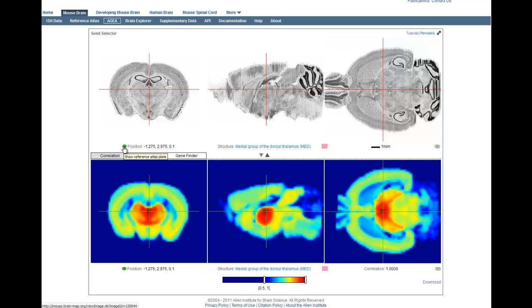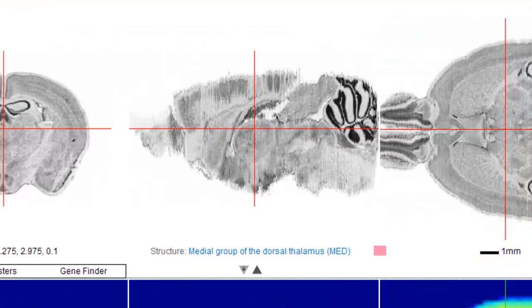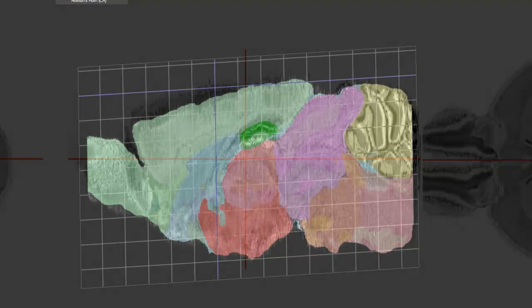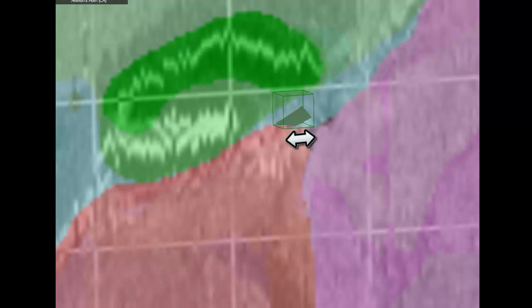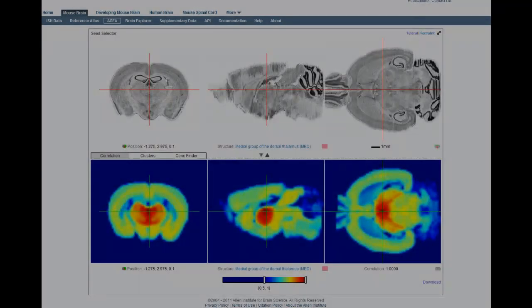The bottom three panels are the corresponding voxel correlation maps. In this default view, the color-coded images in the lower panels depict the correlation of every voxel in the brain to the seed voxel in the upper panel. To explain this requires some background: approximately 4,000 genes were assayed by in-situ hybridization in the coronal plane, and the brain was then divided up into approximately 50,000 small volumes, or voxels, 200 micrometers on a side.